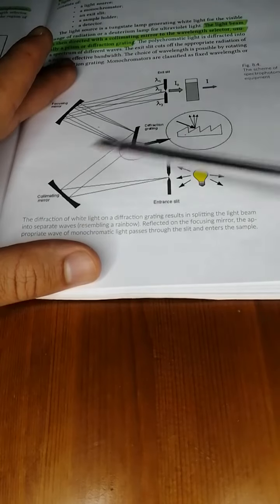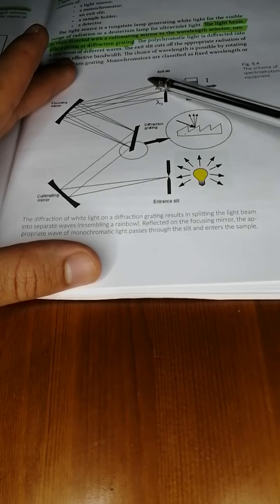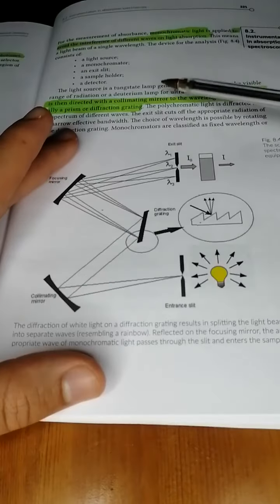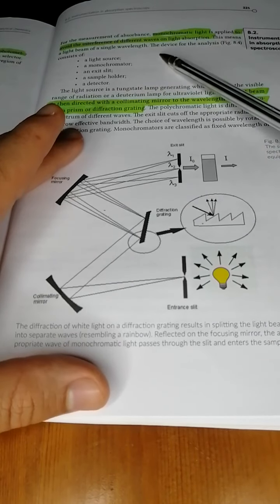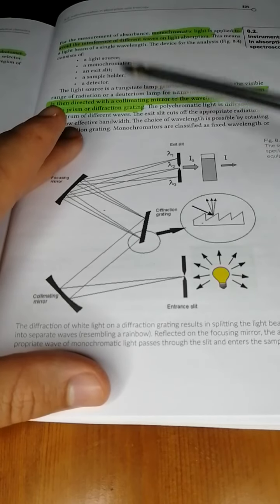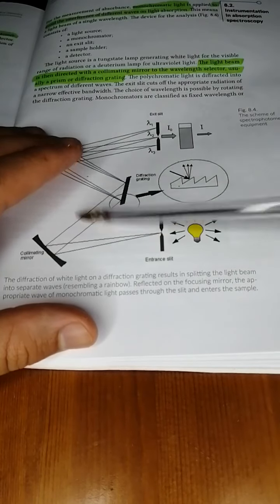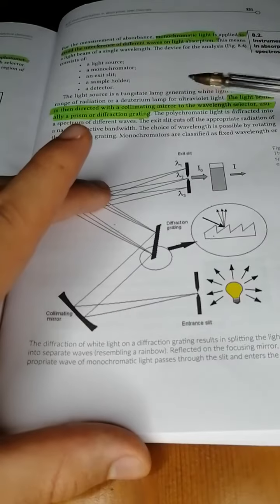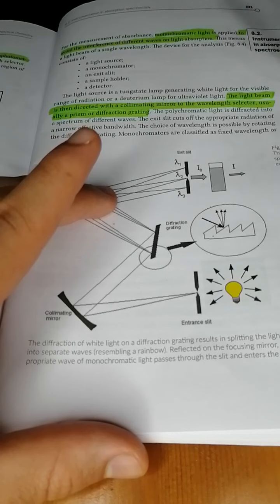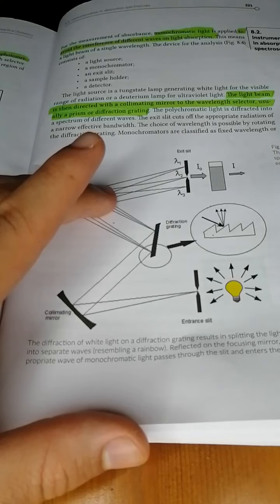Then we separate the light using a diffraction grating into its components, its wavelengths, its colors, and then we can measure the absorbance at a certain wavelength. So you need a monochromator to ensure the light is in a certain color, and an exit slit, which also separates the light into a unidirectional beam. A laser would be great actually, because a laser is very uniform in its properties, but it's just a single wavelength, so visible light is a lot better.